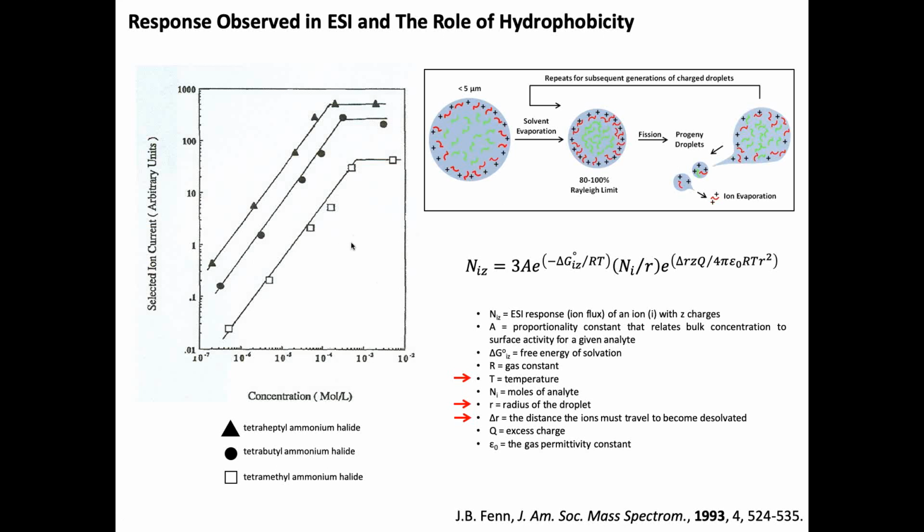Well, good question. I haven't thought of it that way. So there's a couple things. One is, if you think about it from a chromatography standpoint, those things that co-elute, those things that elute at the same time, in general, from a reverse phase standpoint, are not the same hydrophobicity, but they're in the same ballpark. Things that come off at the beginning of the gradient are going to be the most hydrophilic, and those things that come off at the end of your reverse phase gradient are going to be the most hydrophobic.